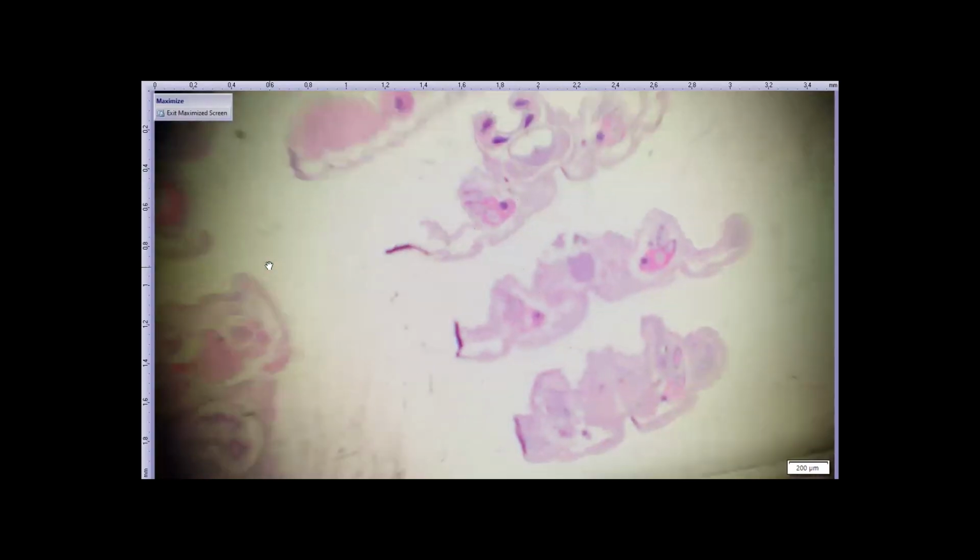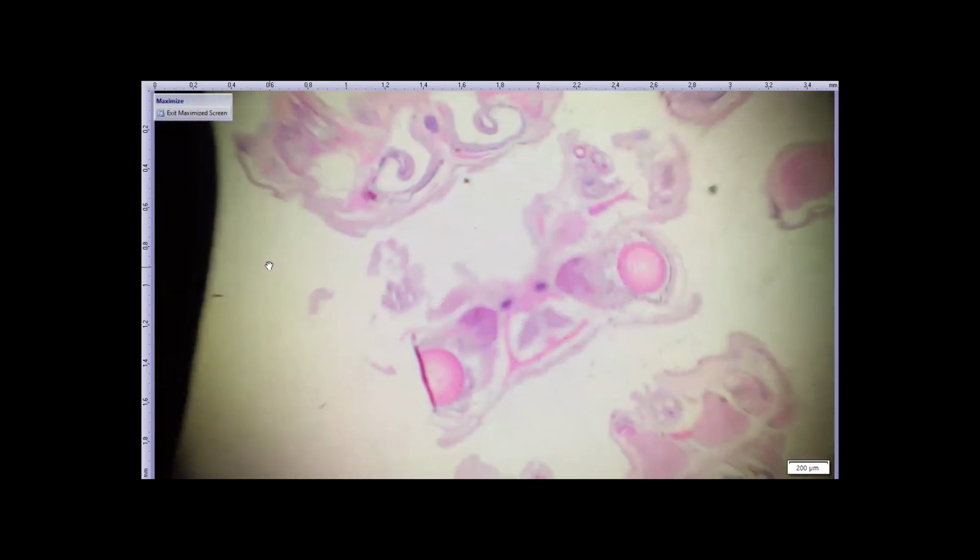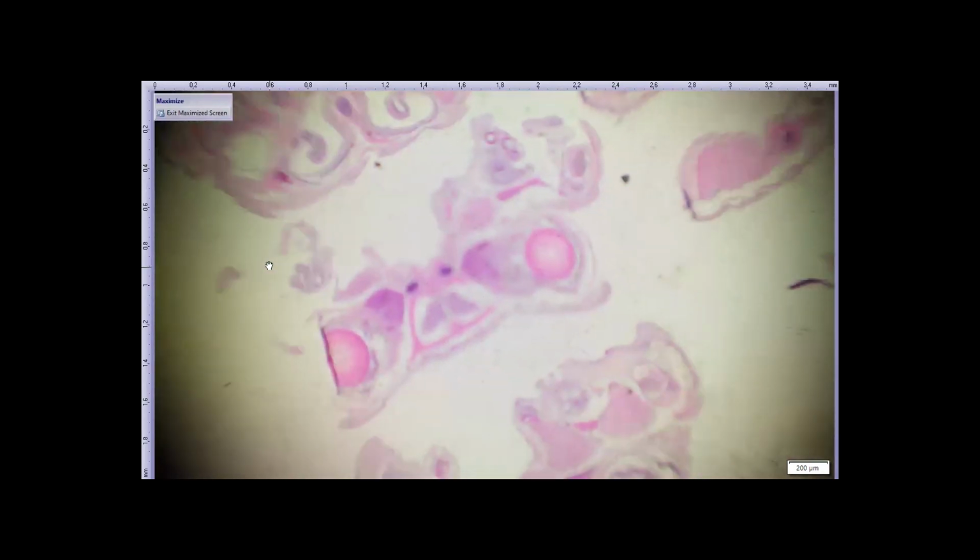The head was cut as you would make slices of bread. You cut through the head as if it was a loaf of bread. So we're going to look at the section that has the eyes. It was a tiny little snake.